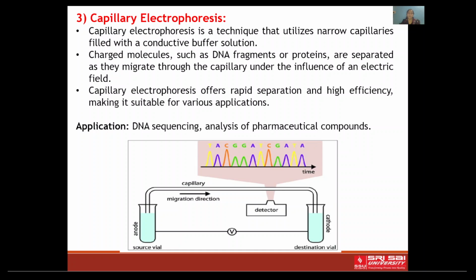Third, capillary electrophoresis. It is a technique that utilizes narrow capillaries filled with conductive buffer solutions. The charged molecules such as DNA fragments and proteins are separated as they migrate through the capillary under the influence of an electric field. Capillary electrophoresis offers rapid separation and high efficiency, making it suitable for various applications. Applications: DNA sequencing and analysis of pharmaceutical compounds.